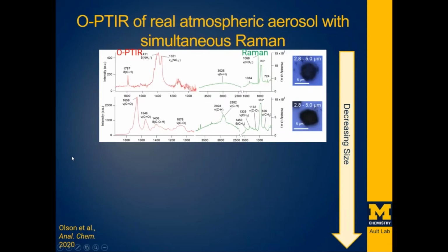This is where I think the power of the Raman and IR together is something that's really going to enable us to push our research forward. We were able to look at a particle where, before, if we had just done Raman, we would have said, okay, here's some nitrate, here's maybe the nitrate asymmetric stretch, but we don't have much really to go on. Maybe there's MH, maybe there isn't. We don't really have great signal.